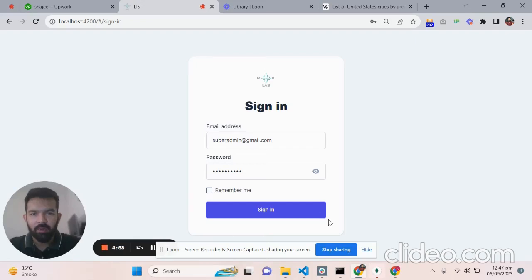Hi there. In this video, I am going to introduce a web app that is developed for medical labs. This application is built using Angular Material, Node.js, and MongoDB. So let me introduce you to what features I have provided in this application.